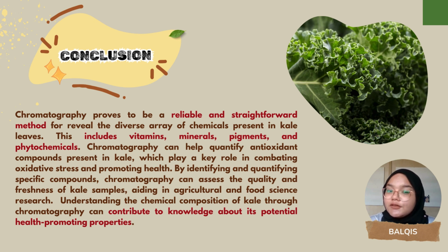Chromatography can help quantify antioxidant compounds present in kale, which play a key role in combating oxidative stress and promoting health. By identifying and quantifying specific compounds, chromatography can assess the quality and freshness of kale samples, aiding in agricultural and food science research.